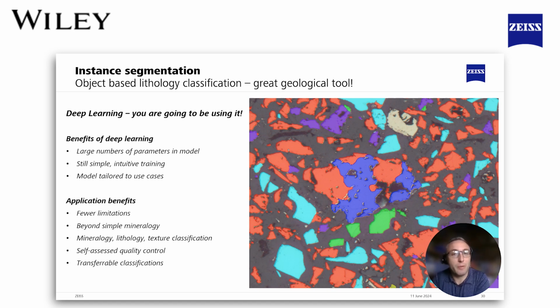We look at it on something like a rotating stage optical microscope in polarized light to understand very subtle differences between different minerals. And finally, we have a segmentation tool that's taking on board all of that information that we're used to using.